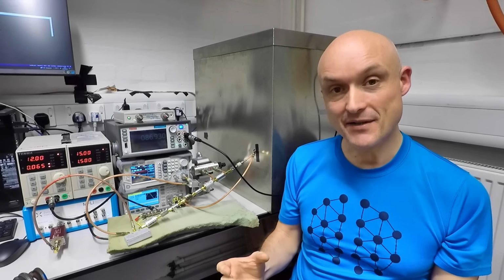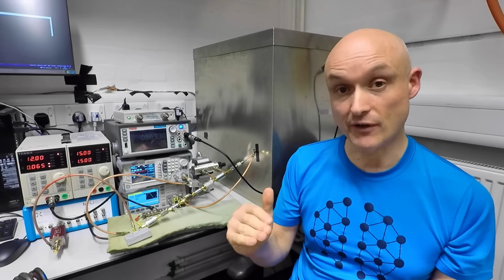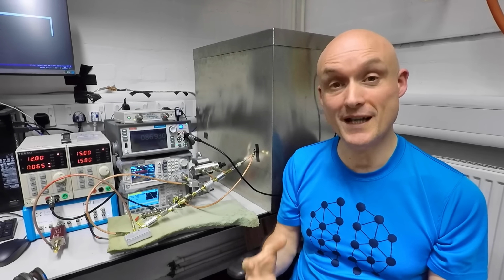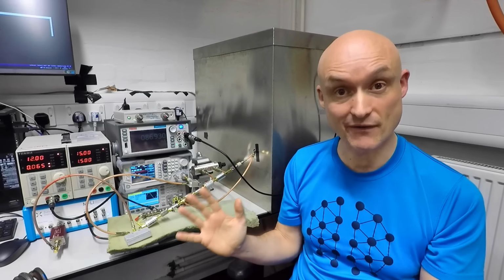And what we do is we get a sample containing atoms which contain unpaired electrons in a particular atomic orbital. And we cause those electrons to transition from the lower energy state to the higher energy state, and back again. And the way we do that is we put the sample in an oscillating magnetic field driven by an electromagnetic wave whose frequency corresponds to the amount of energy required to cause the transition. And that whole thing sits inside the static magnetic field.